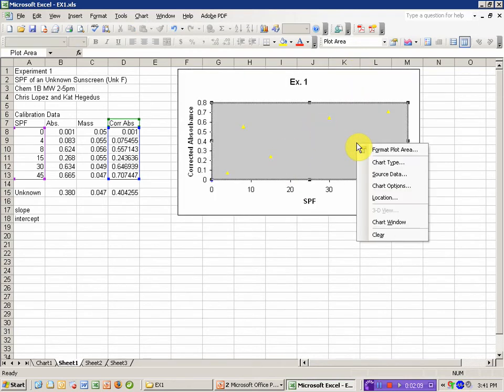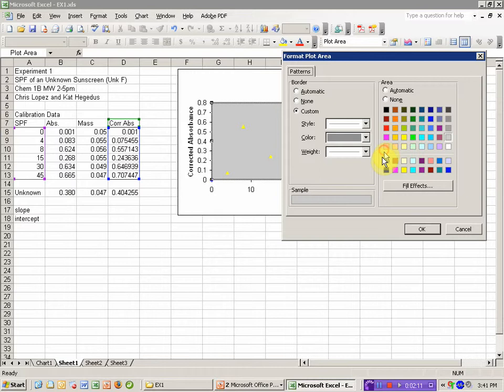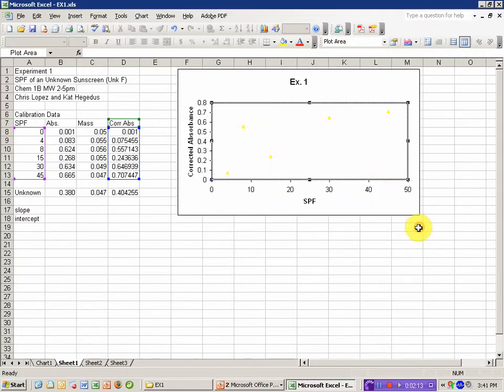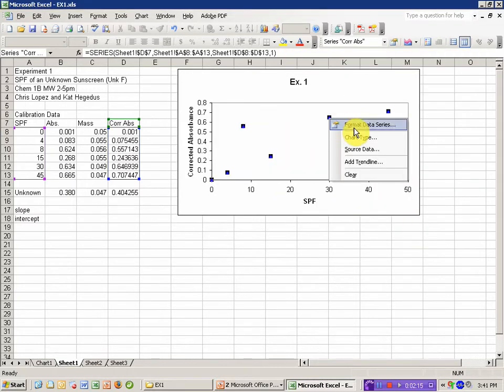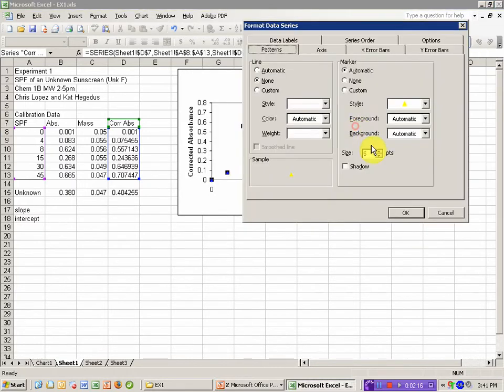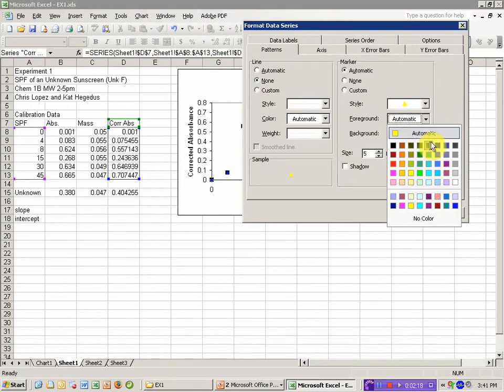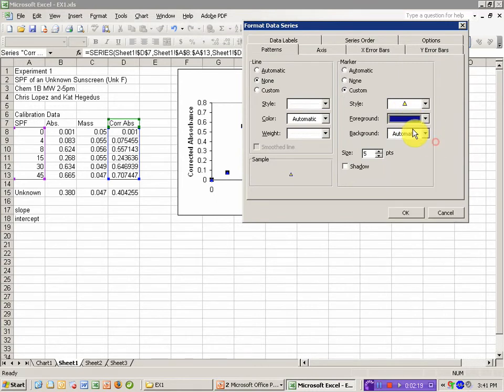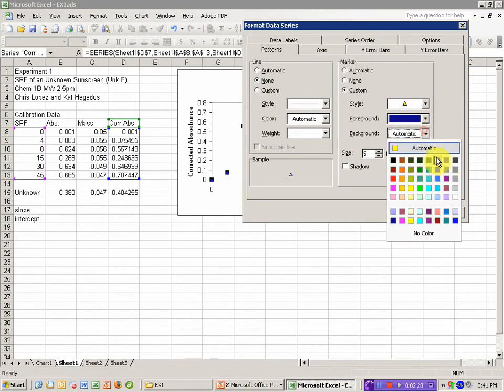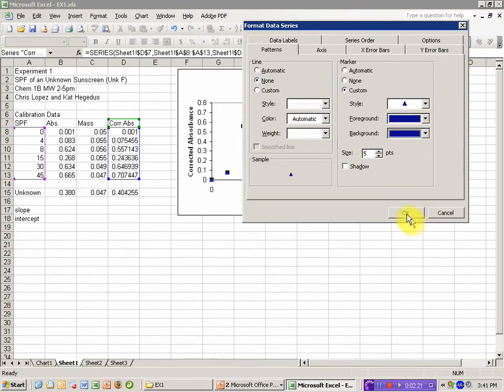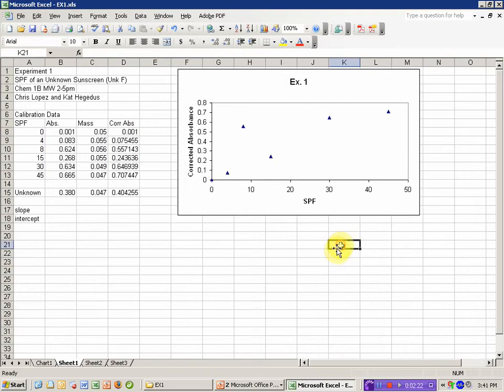I'm going to get rid of the background by right-clicking on it, format plot area. And I'm going to change the color of this data series because I'm having trouble seeing it. So I'm going to make it a nice dark blue. And there's my data.